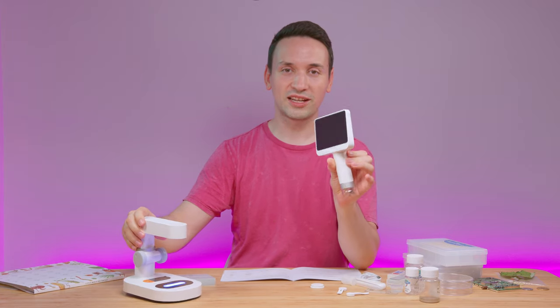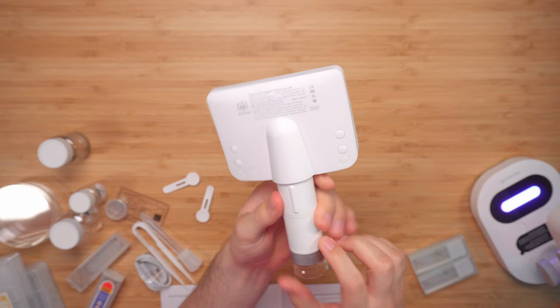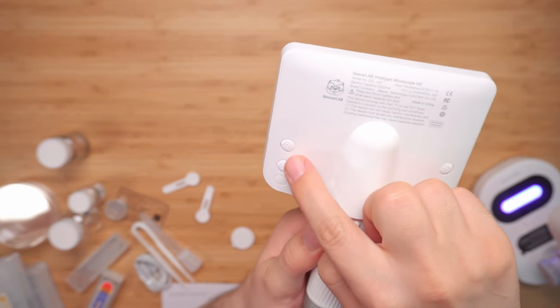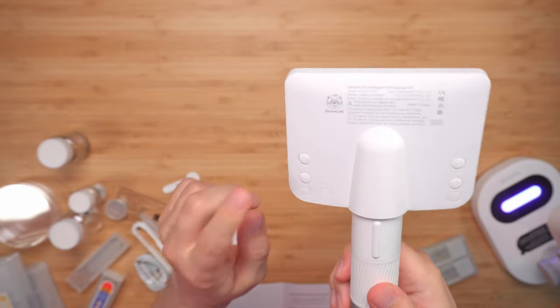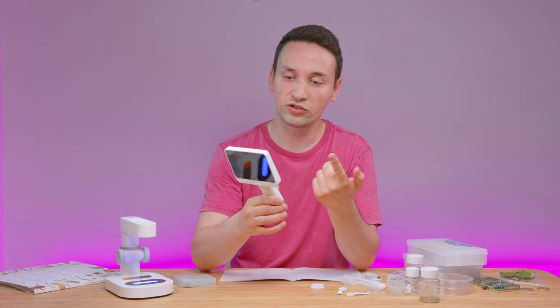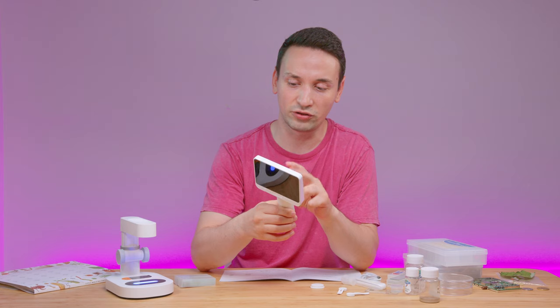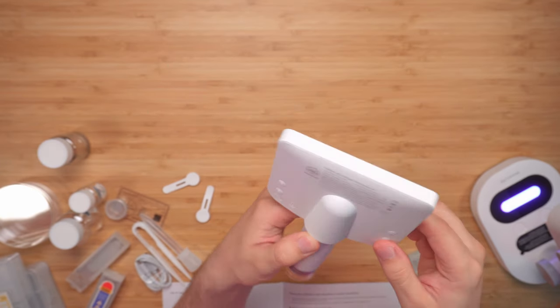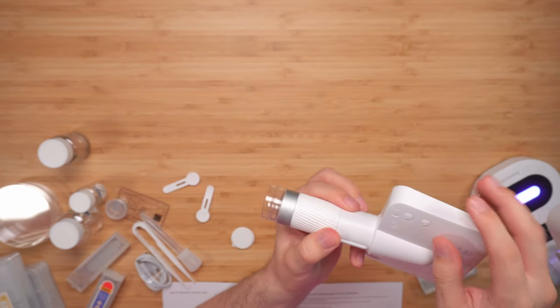Looking at the main unit, there are a few buttons on the back. We have plus and minus for digital zoom, and the power button — just hold it for about three seconds to turn it on. Then we have brightness level buttons, up and down, which control the light.